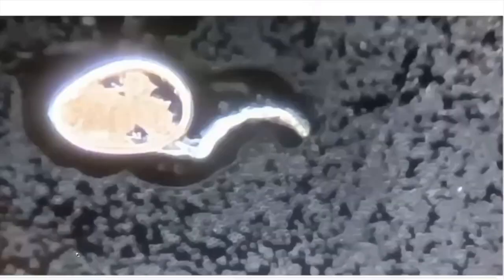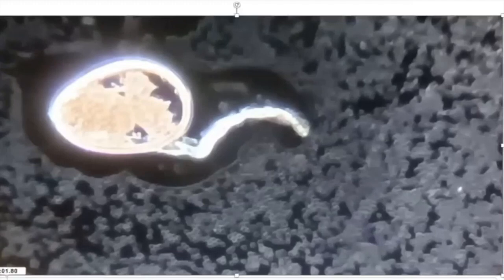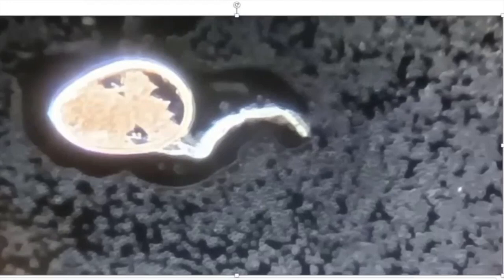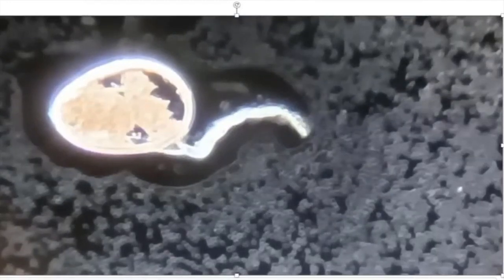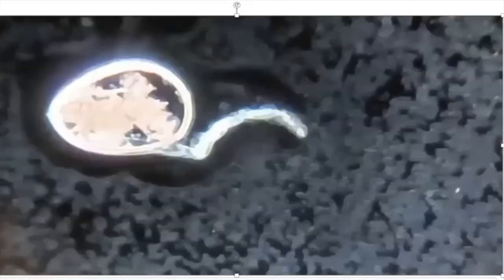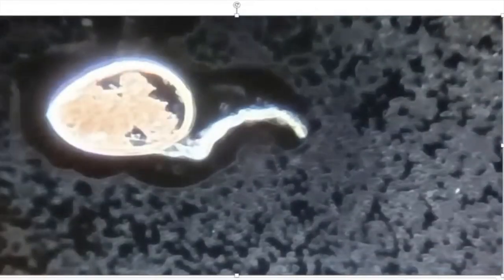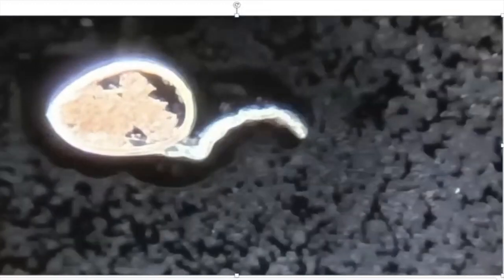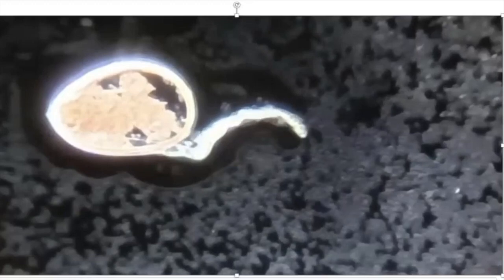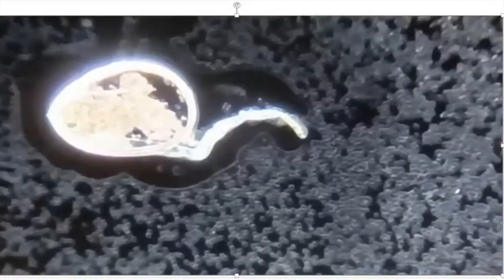This is the only video that's not mine. Somebody sent this to me, and I found this quite interesting, because if I just quickly play this, you will see that this construction site or polymer connected up with one of these structures is actually sucking red blood cells into its body. I found that really fascinating because we know that potentially these structures are using our red blood cells, or harvesting them, to create their own structures and for their energy.